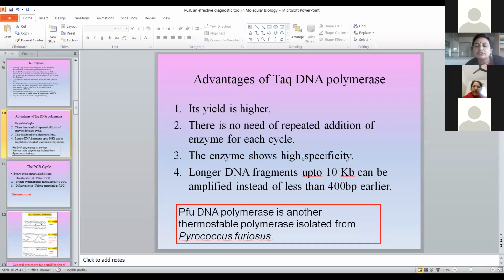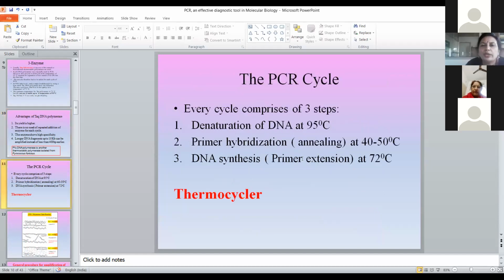The machine is ordered to carry out these many cycles. And at the end, a beep will be given by the machine. Yes, all the cycles are over, the DNA is amplified. So the machine that is used is called a thermocycler, number one. Number two, as I said, you require sample DNA, target DNA, DNA template. Number 3, dNTPs, magnesium ion, Taq polymerase. All these are the requirements.